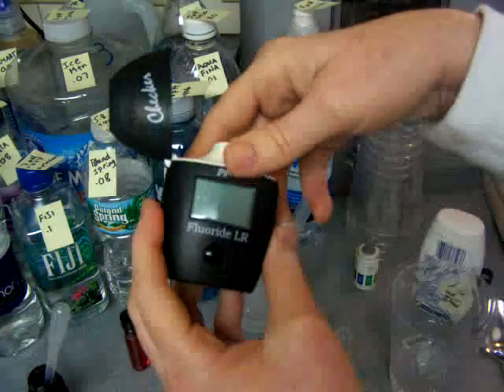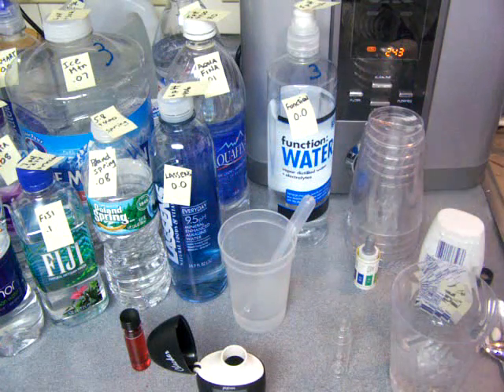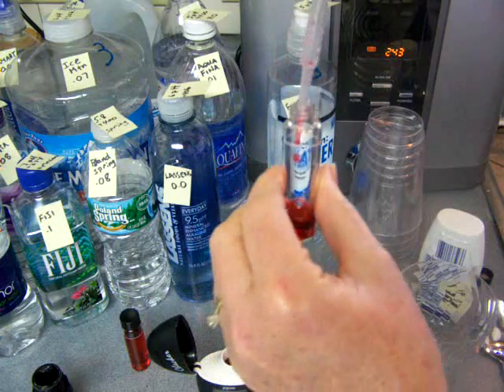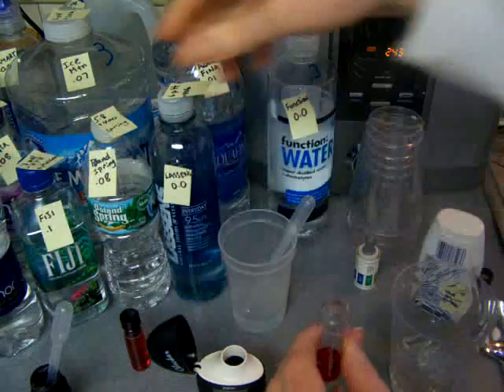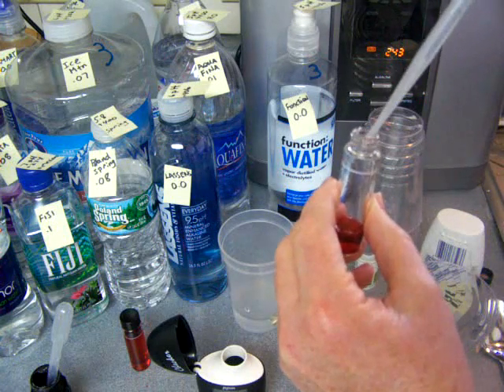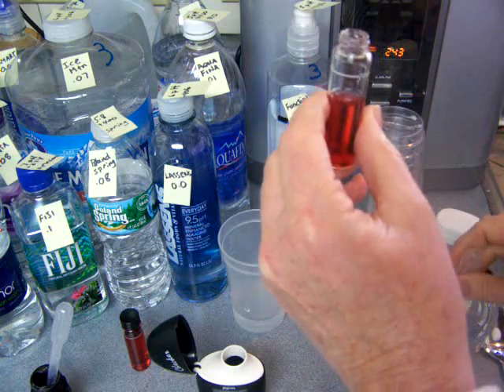This is a fluoride tester. I'm just going to add some reagent drops to it to start with. It's a Hanna Instruments tester. To get all this equipment was a couple hundred dollars, so it's not cheap to get the equipment to test fluoride. But I'm glad I did — it's very good knowledge to have.